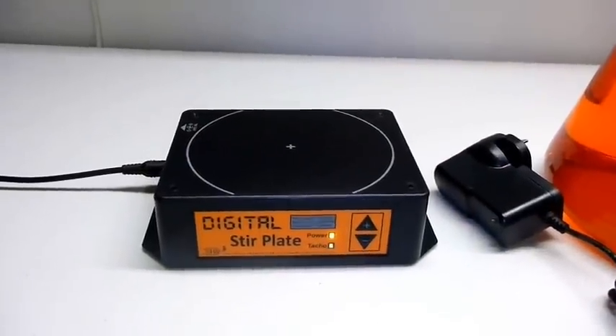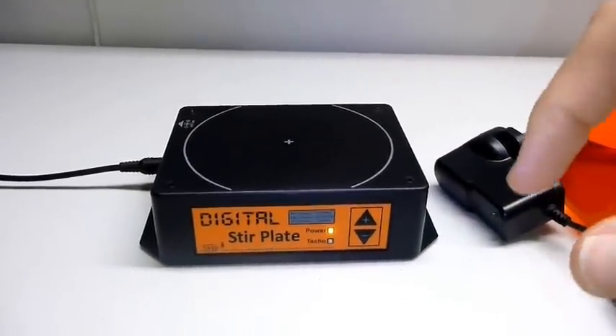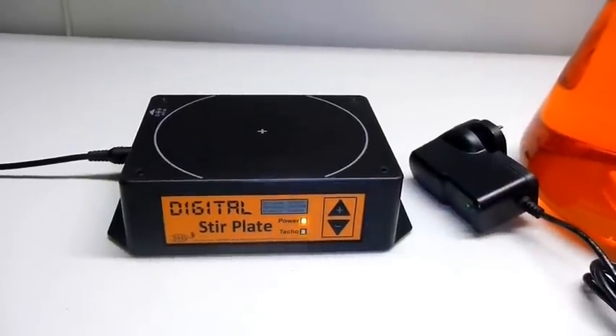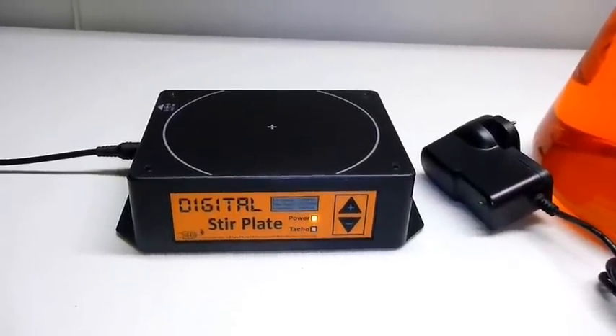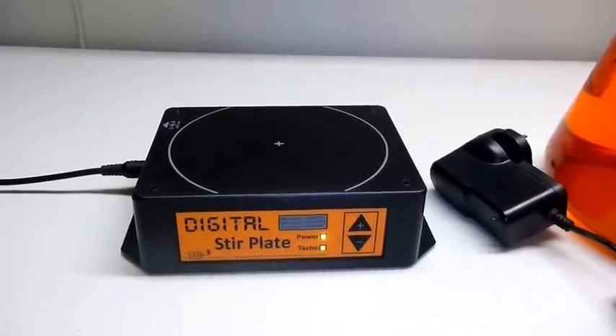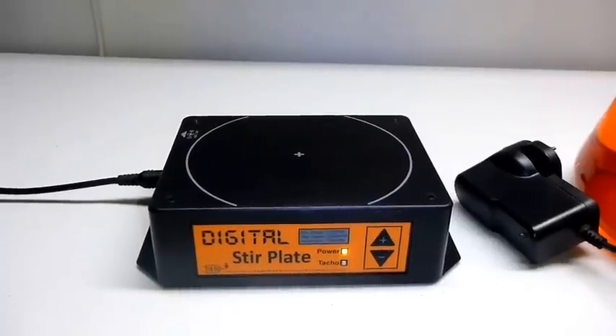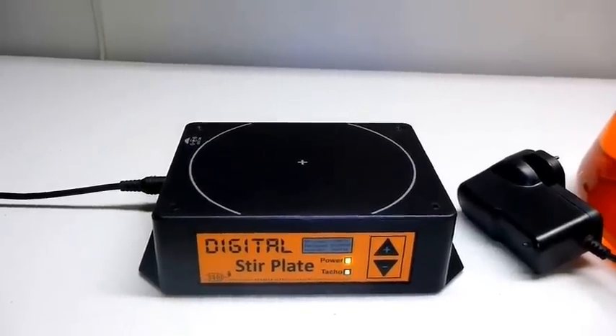Also, maybe cell destruction could be a factor when your stir plate is spinning around — maybe that could be a factor. But the bottom line is that it's going to give you similar cell counts hopefully, similar conditions for the yeast to grow between your starters, and that's hopefully going to give you a more consistent pitching rate in your beer.